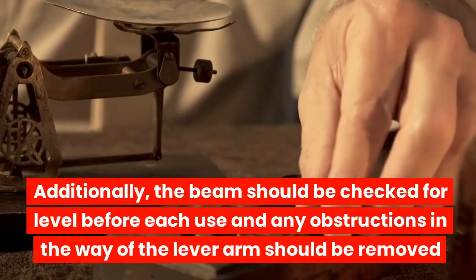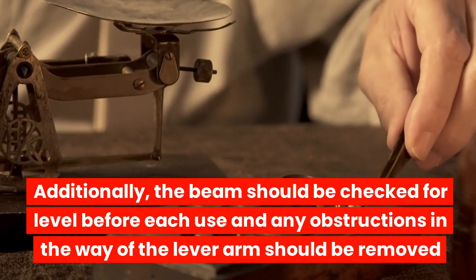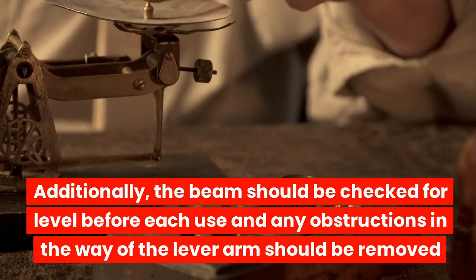Additionally, the beam should be checked for level before each use, and any obstructions in the way of the lever arm should be removed.